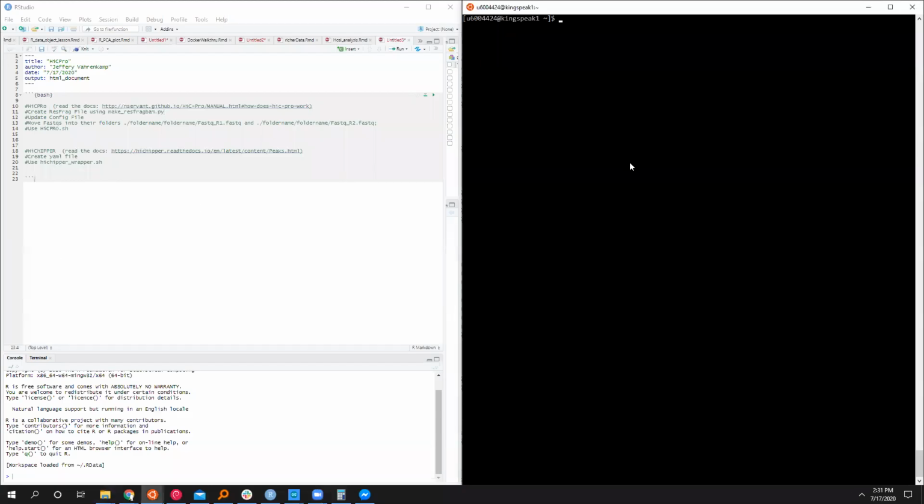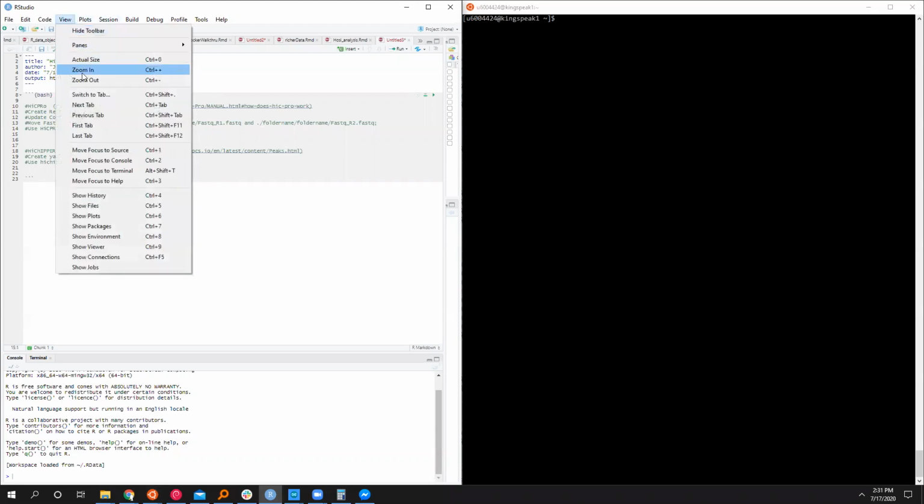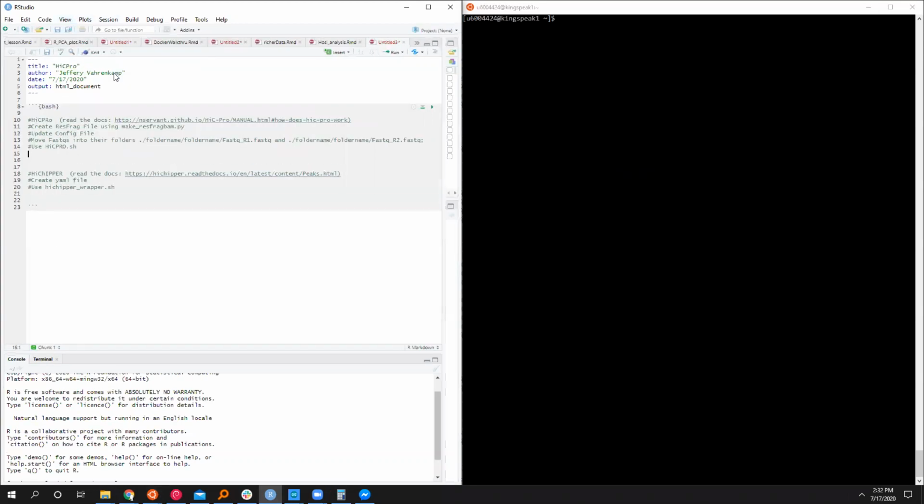Okay, so I'm going to try and walk through some HiC analysis using HiC Pro and HiChipper. This may be a little rough because this is kind of a weird, complicated walkthrough, but we'll give it our best shot here. I wonder if I can blow up the font here. There we go.